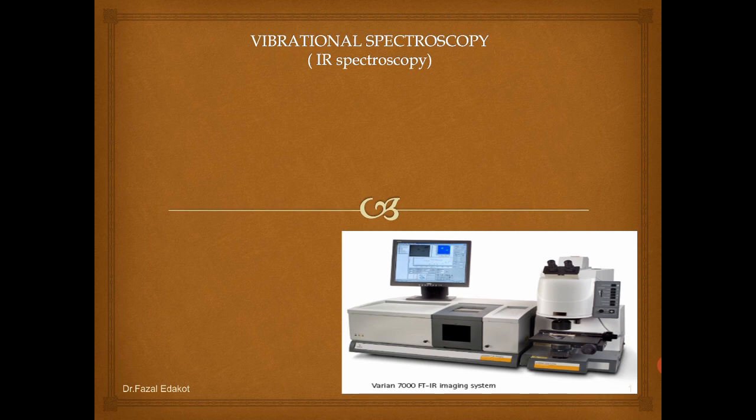Just before, I was asking where the infrared radiation influences the energy of the molecule, that is the vibrational energy. So the vibration is influenced by infrared radiation.